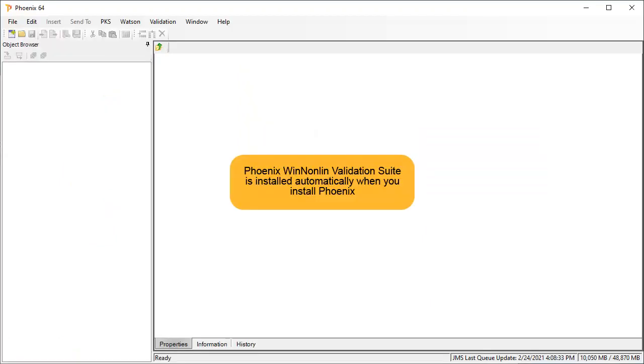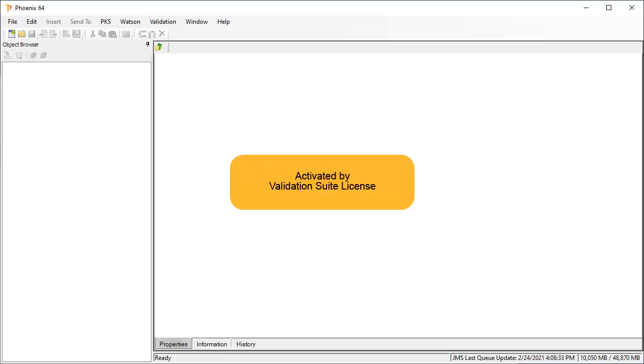The Phoenix WinNonlin Validation Suite is installed automatically into Phoenix, and therefore it makes it easier to run the validation test. It is activated by the Validation Suite license.